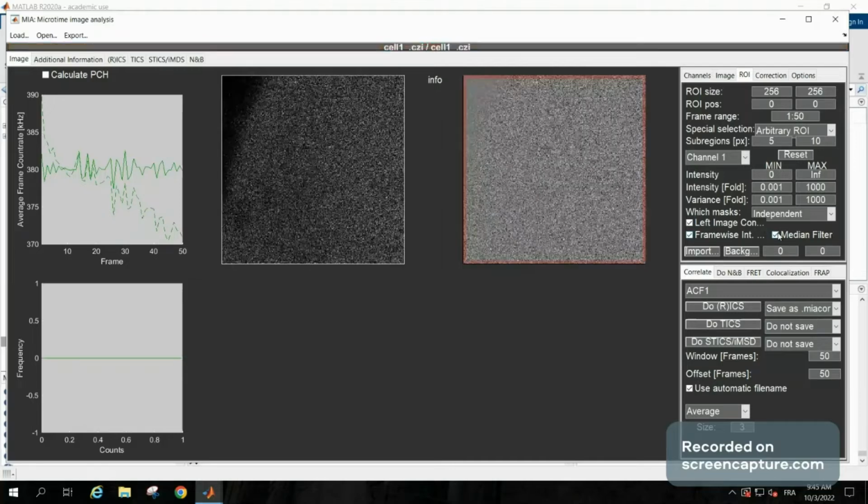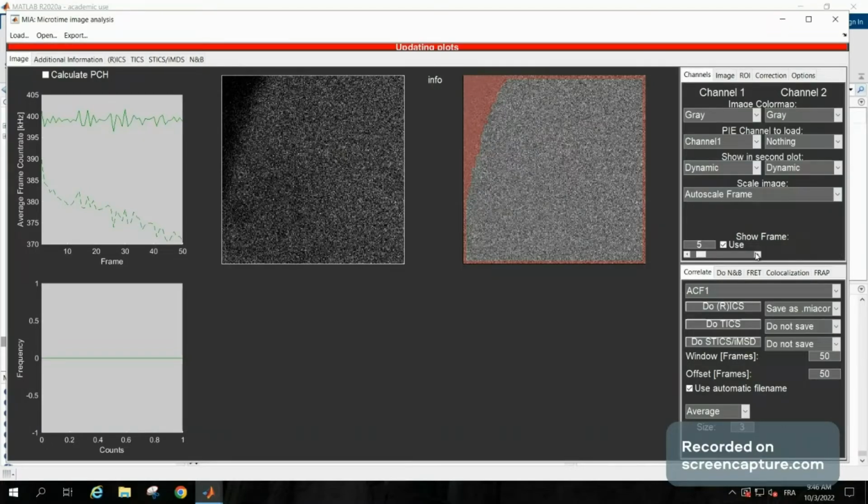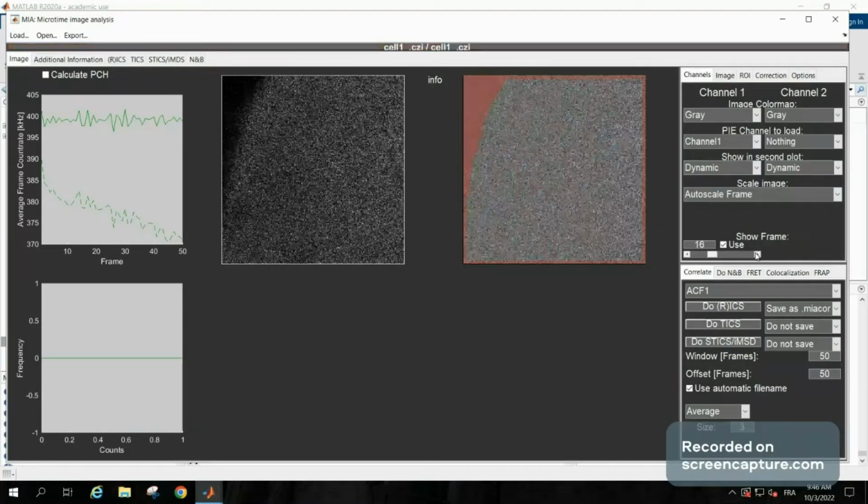I'm not going to explain too much about this analysis, but I'm just going to show you how to do an intensity threshold. I'm going to give 200 and see if just the region that is extracellular is excluded, and it automatically gets excluded, which is nice. And you don't need anything else because you don't have an aggregate in this cell, or so I remember.